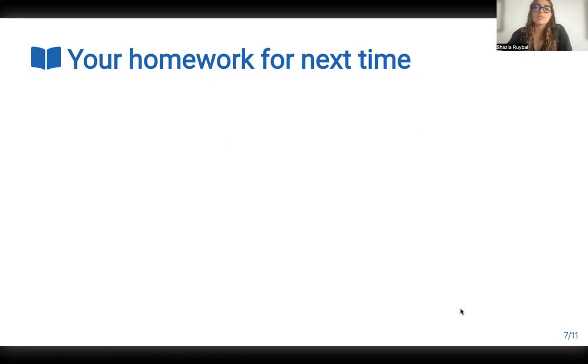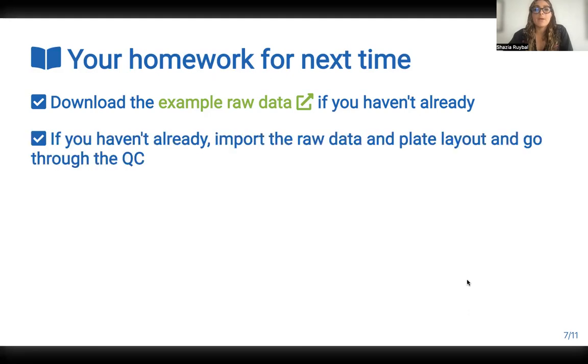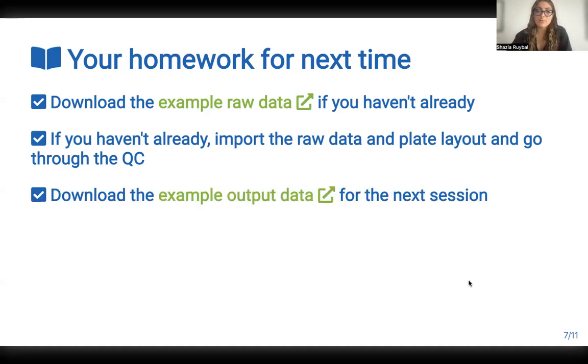I did want to assign, and again, I shouldn't call it homework because we're not in school, things that you might want to do before the next session if you have time. I know that we're all very busy, but hopefully you're excited and at least wanting to explore the app a bit. So if you have time, you can download the example raw data if you haven't already. And if you haven't already, you can give it a go to import the raw data and the plate layout and just go through the QC section and all of the different plots.